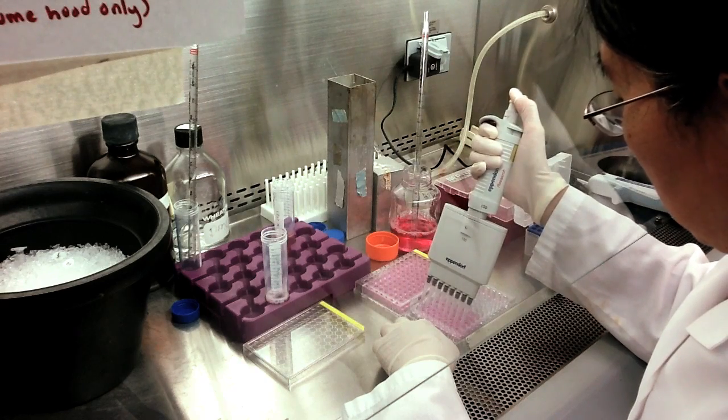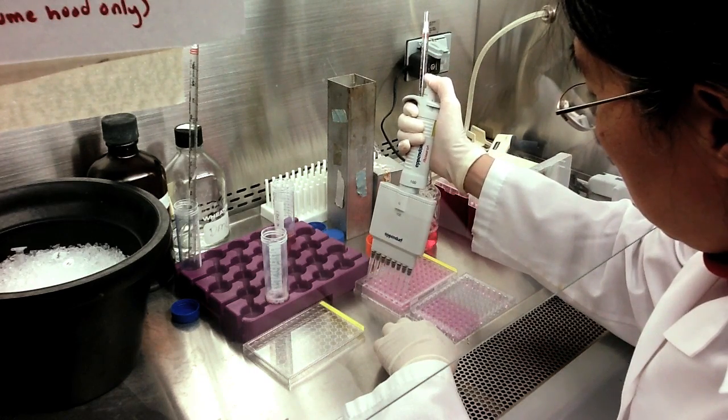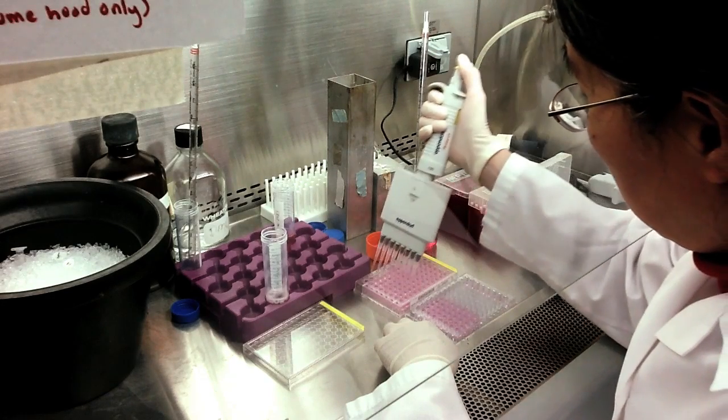50 microliters of serially diluted FGFs are then transferred from the serial dilution plate to its corresponding well in the cell assay plate.